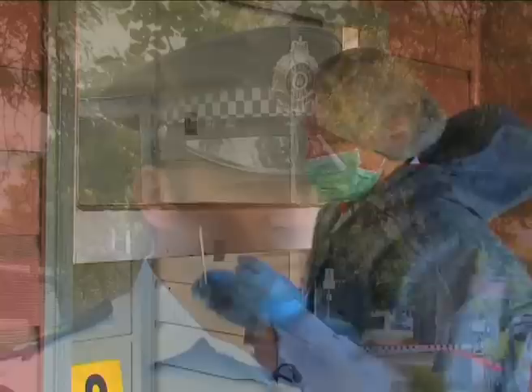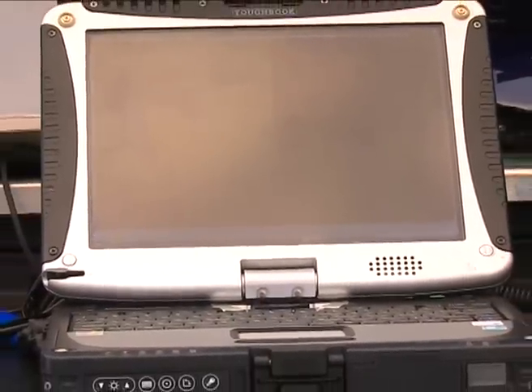Can you tell us what techniques you're using today that you didn't use five years ago? Well, the DNA technique we would use — this is a non-porous surface we're taking DNA from on the window — but if we were to have a porous surface, we have a DNA tape lift. There's been a number of changes in forensics. Obviously the introduction of DNA is world-known. There's also been significant changes in technology applied to forensics. A key one was a change to digital imaging away from silver halide-type recording. Great changes in mobile computing technology and wireless networking have also been significant, and all of those have found their way into the workplace with significant benefits to forensic activities.